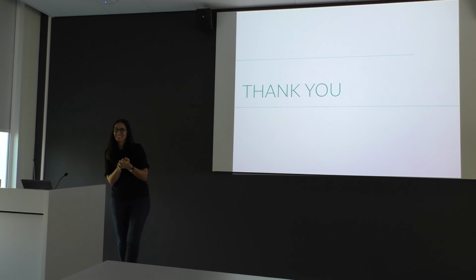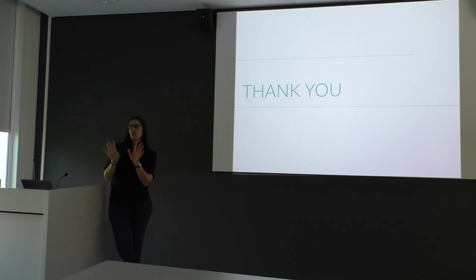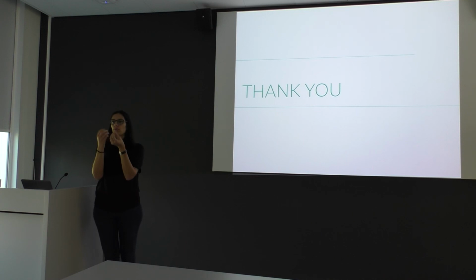Practical question. You said you have more ice content issues, so how long can you realistically imagine? Yeah, right at the beginning we were actually very worried. At the beginning our leopard skin tests told us at most 48 hours, and then you should actually trash them. But this of course also depends on what you're looking at. We are dealing with small particles. If you start having leopard skin, so everyone is aware what that is, this graininess, when the ice starts falling on top of your sample and you have this graininess.